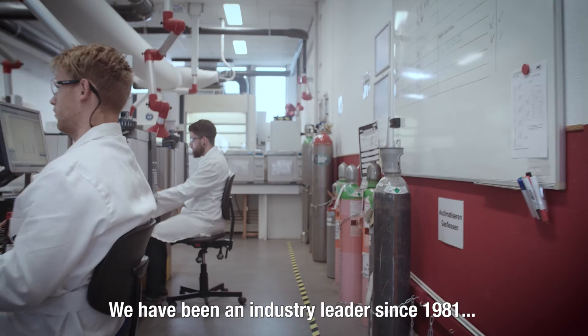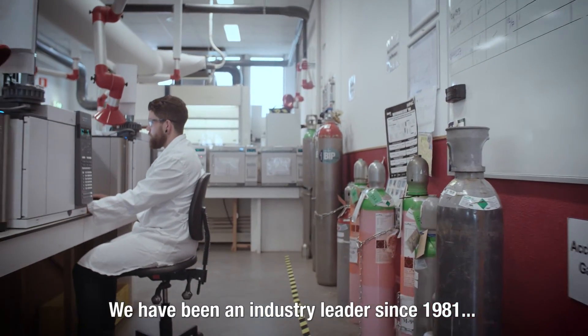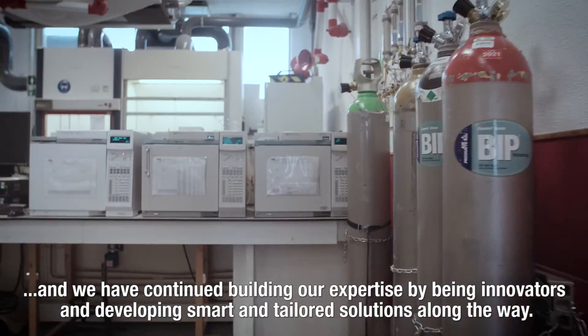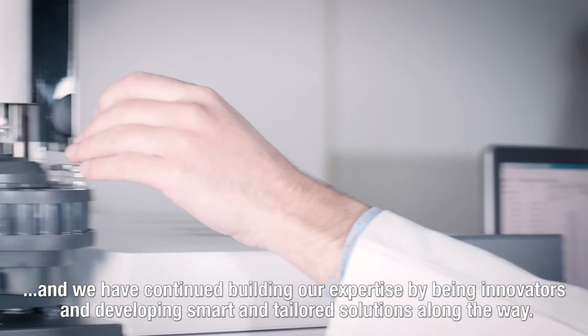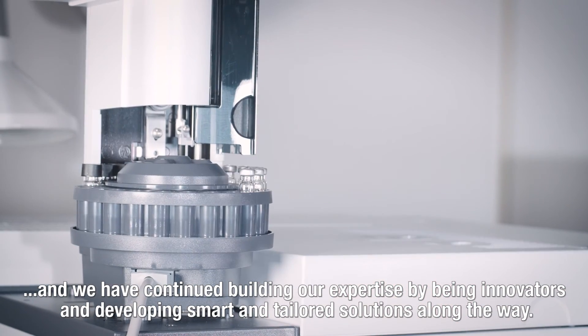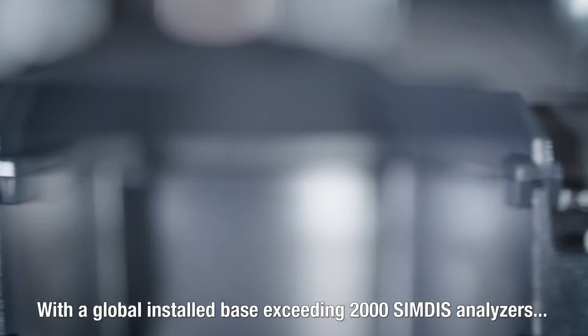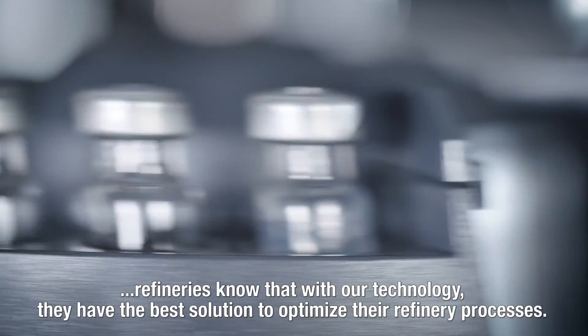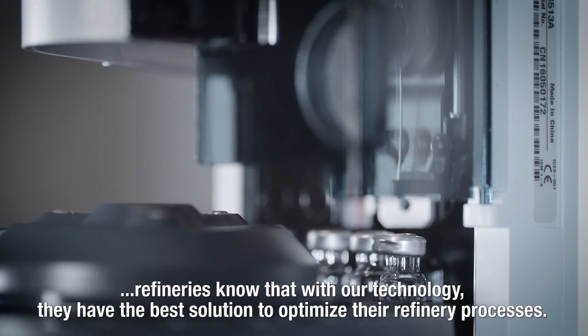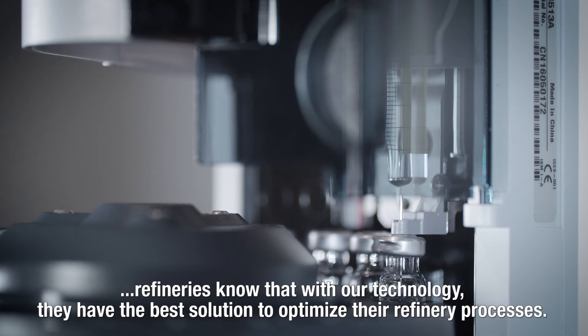We have been an industry leader since 1981 and we've continued building our expertise by being innovators and developing smart and tailored solutions along the way. With a global installed base exceeding 2,000 SIMDIS analyzers, refineries know that with our technology they have the best solution to optimize their refinery processes.